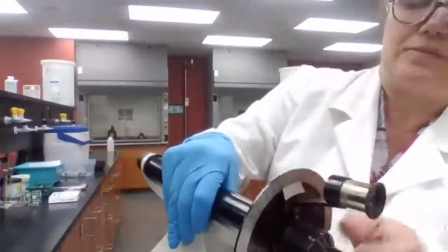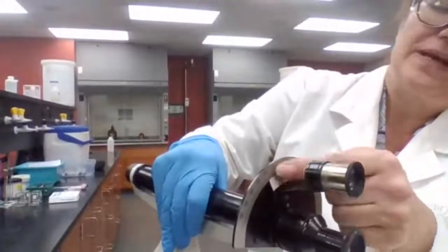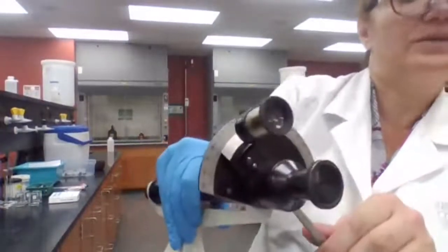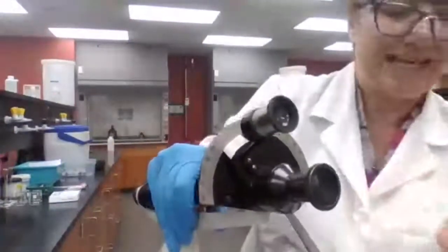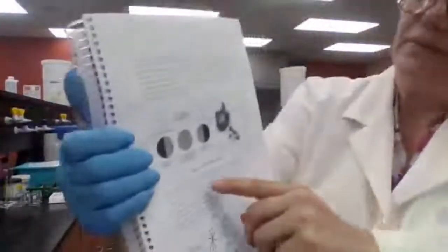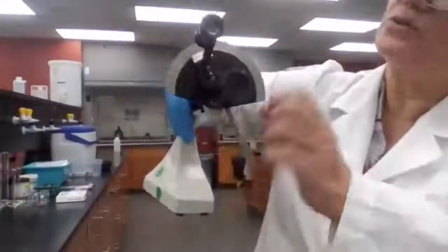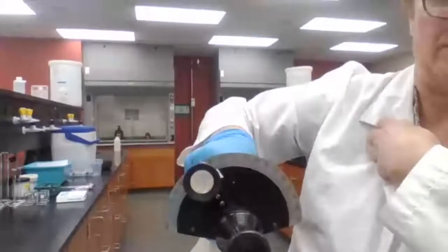I'm going to have to start from 0, 0. There's a number here on the movable piece, and then this fixed plate, number 0, aligned with the 0 with no rotation. And then I'm going to move to the left side or to the right side, depending on which side was darker. I'm going to move it until I see the same shade again. When I see the same shade again, then I count by how many degrees the filter was rotated in order to see the light again, and that is going to be my observed rotation.